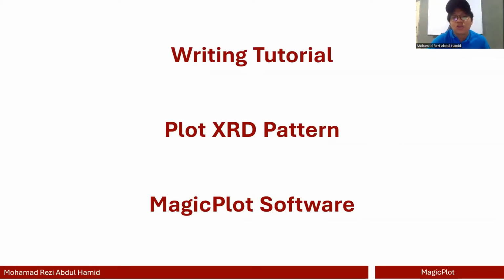It's me again. So for this week's video, we are not going to talk about Aspen Plus because I haven't prepared anything at all this week. So I decided to do something else. For this video, I decided to show you a cool software that you can use to create a nice plot. For example, you can plot an XRD pattern. In this case, we're going to plot an XRD pattern. You can also plot, for example, a TGA curve, NMR spectra, UV-Vis, or even FTIR spectra, whatever you have. And the software that we're going to use today is called MagicPlot.